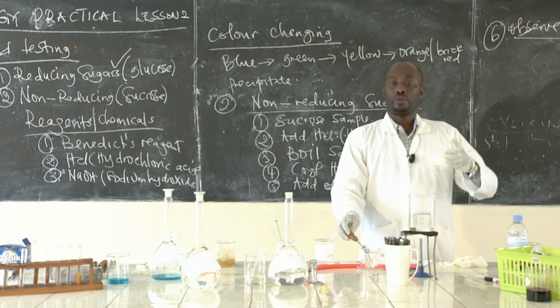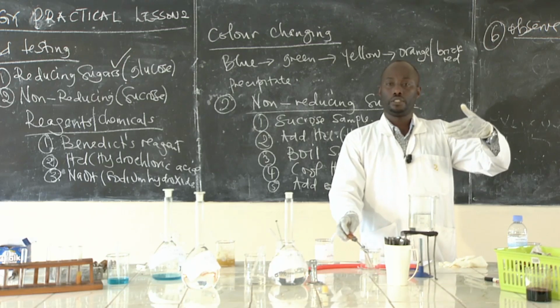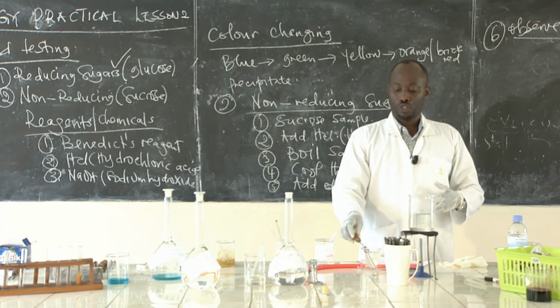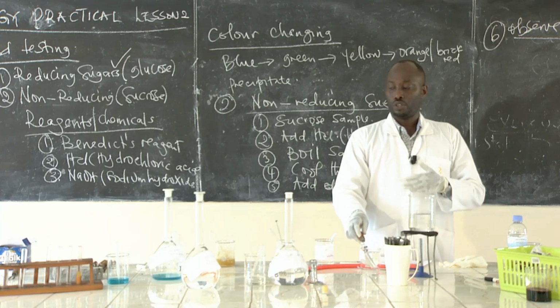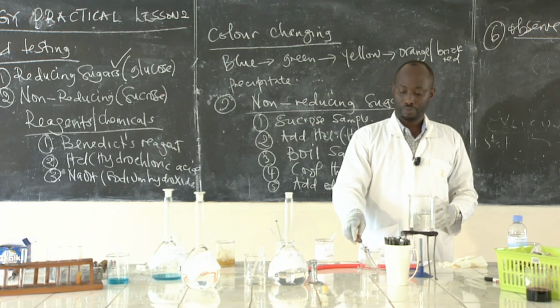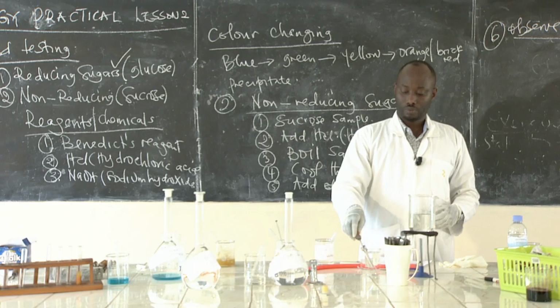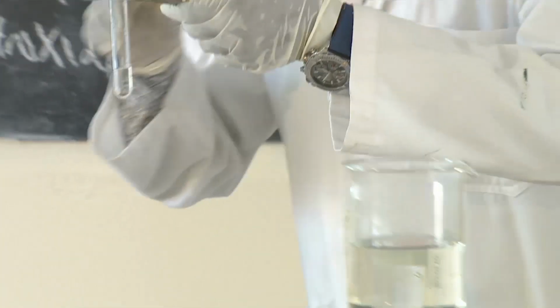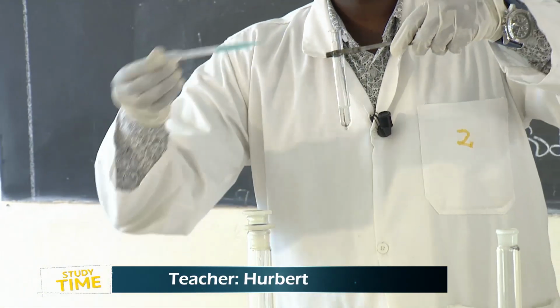You cool it. You take like 3 to 4 minutes of cooling, and then after you remove the sample, you add a Benedict's solution. I think it is cool. You add now the Benedict's solution.